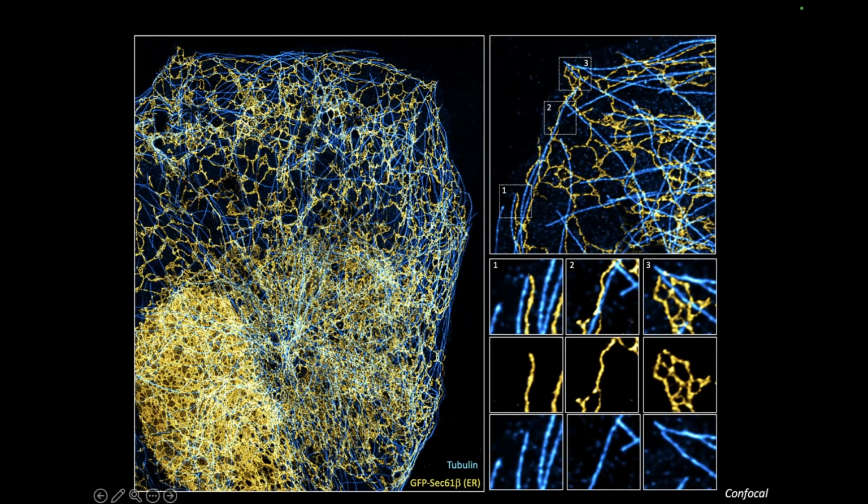Like this touching point at the tip of the microtubule doesn't last more than seconds. So we're quite happy to see this touching behavior or even the sliding. I mean, of course, it does not slide, but it looks like it. And that was really for us a proof that we are really snap freezing these cells at the moment that this is happening.